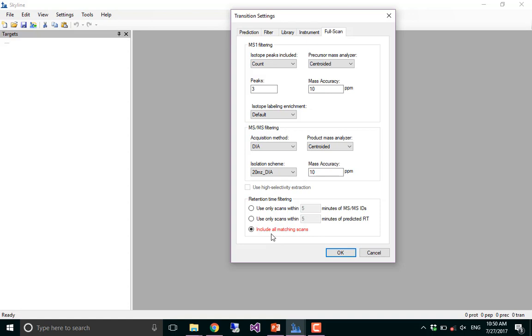That's what we do now. So when I actually acquire data, I do MS1 in profile and MS2 in centroid. The profile data becomes so large, the files are so big, and I don't see a big benefit to having the profile data over the centroided, so I tend to just go ahead and acquire centroid. That's speaking for the instruments I'm familiar with, so that's going to be the Fusion series and the Q Exactive series.